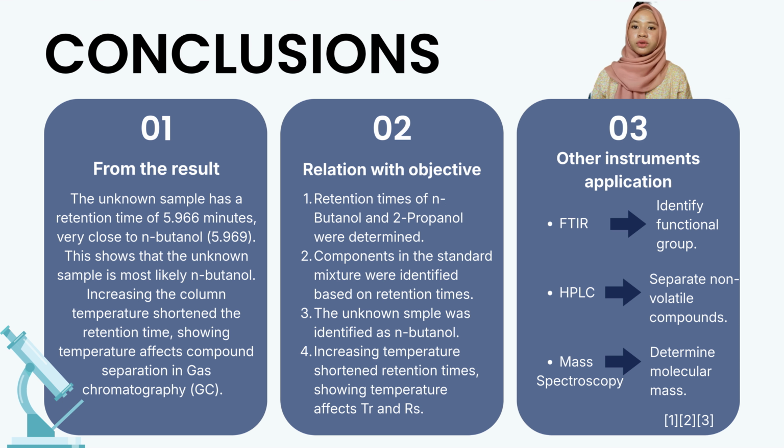The result also showed that increasing the column temperature shortened the retention times, indicating that temperature has a significant effect on retention time, which is TR, and resolution, RS. These observations support the objective of studying the influence of operating conditions on chromatographic separation.